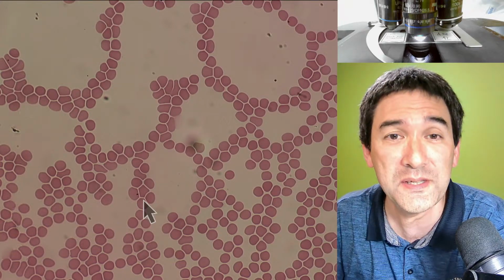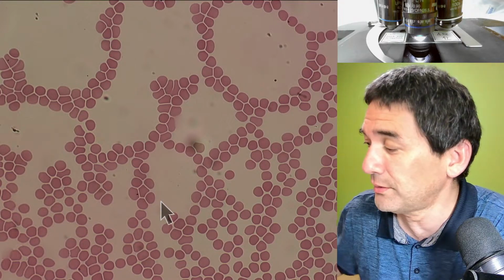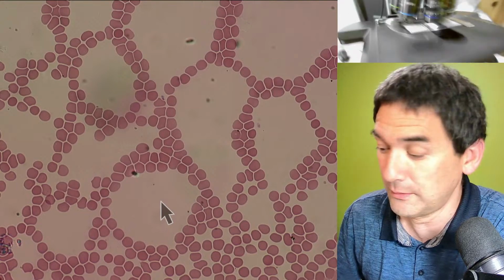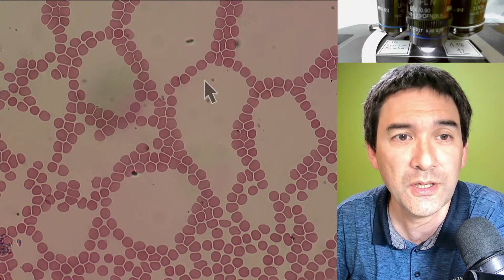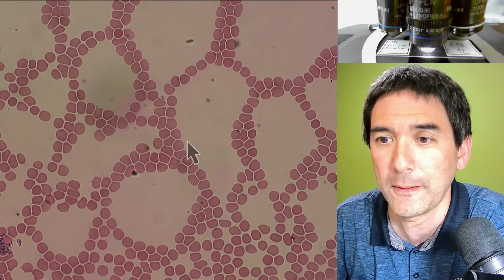Okay, so these are basically two indicators here that we're dealing with a prepared microscope slide. Here exactly, I bumped the camera here. We see it even more, right? That there are basically those empty spaces here, and that is because of the drying of the blood sample.